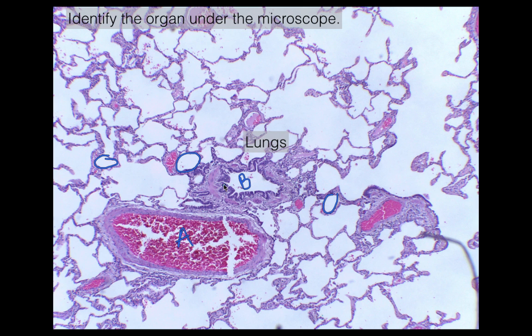We also have capillaries — these slides are from your lab by the way — and you can see a little capillary there. You'll typically find them in between the alveoli. There's another one right there; they're kind of these little circles in between the alveoli.